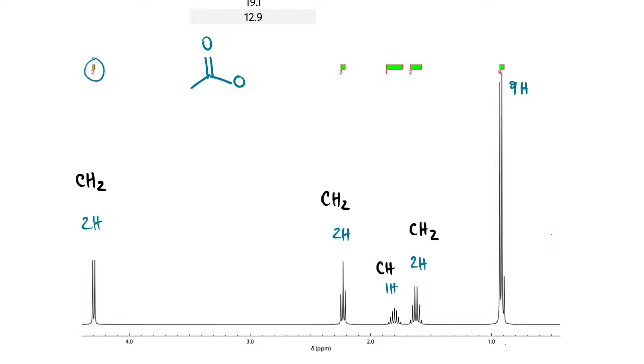If that was a tert-butyl group, and a tert-butyl group is something like that, why is this signal not a tert-butyl group? It's not a singlet, okay? We'll go back to multiplicity in a second. So it's highly likely that the 9 comes from maybe 2 signals on top of one another. Okay? I'm going to erase that. And let's go back to our chemical shift. So our CH2 that's farthest away, what's the multiplicity?